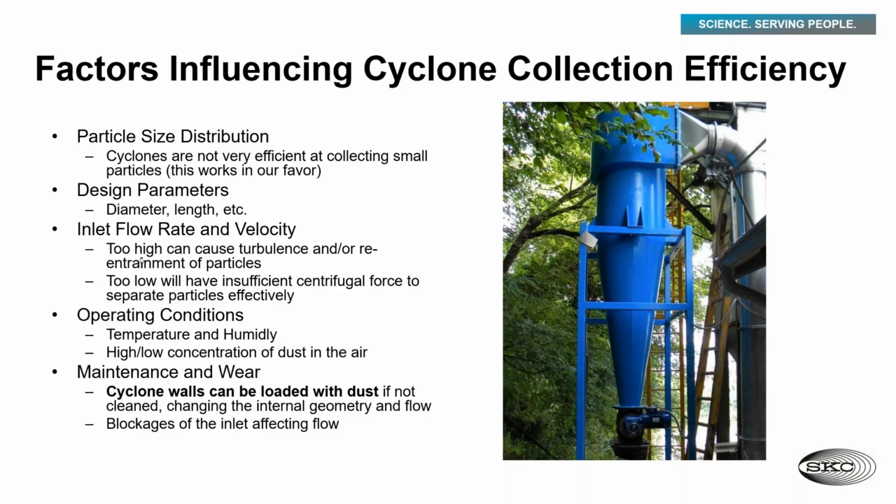So you're making that curve tighter, and you're going to end up spinning out more smaller particles than you would otherwise. So you're effectively reducing your cut point if you choose not to clean your cyclone, which is not a good idea. Other things that can really impact it are blockages.